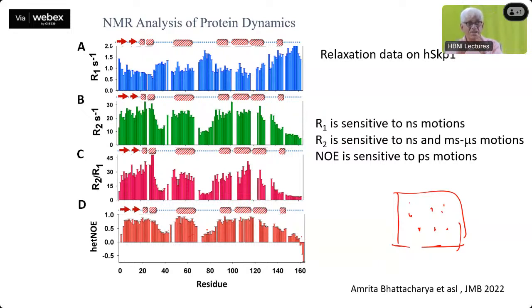So there is a segment-wise variation in the motions. Apart from the tumbling motions which you are talking about, there is a segment-wise variation in the polypeptide chain. These are extremely important from the point of view of the functions of molecules, which areas are functionally important. Now, if there is a loop which is flexible, then it becomes like a scavenger to bind some other target molecule, a ligand which is present. It can go and figure out, it can bind anywhere, it can adopt the structure. So that is the benefit of the loops. Therefore, often we see the loops are involved in biological function.